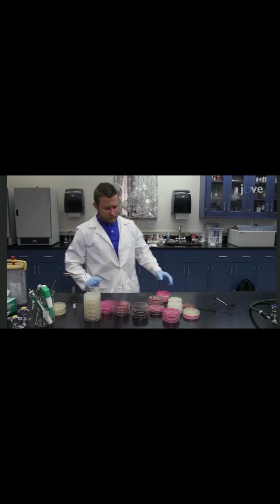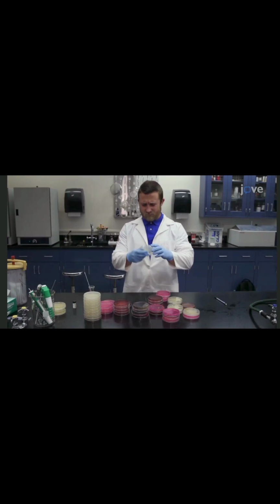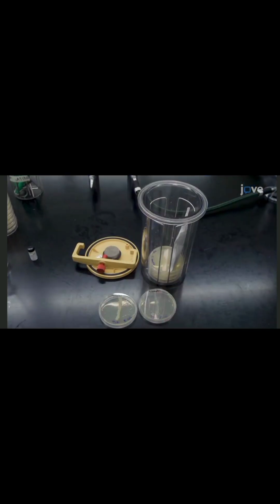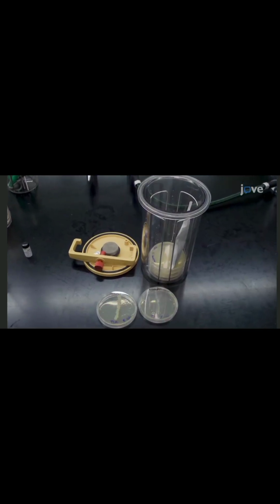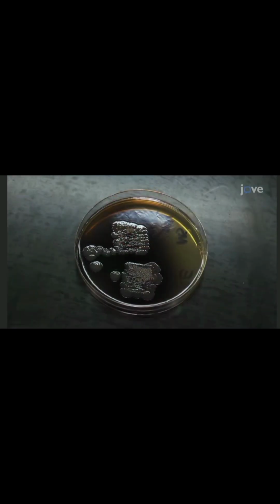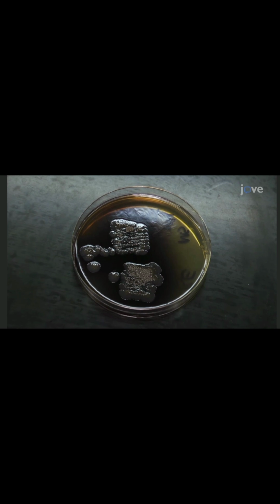To assess how well the different bacterial species responded to each growth condition, first examine the plates for growth and record which species were able to produce colonies on each media type and in the anaerobic versus aerobic condition. Note the color of the organisms growing, as well as the sizes and shape of the colonies.